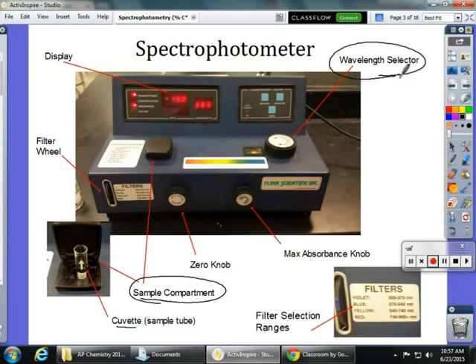You see that over on the right of this one, and there's some kind of device that allows you to choose your wavelength. When you set the wavelength, most of them have a filter on them. So if you look on the far left of our diagram of the picture, you see this filter wheel, and there's a zoom in of the tag that's on it. You'll see that the filter wheel, in this case, is set at blue. You'll see a little blue right there on the wheel.